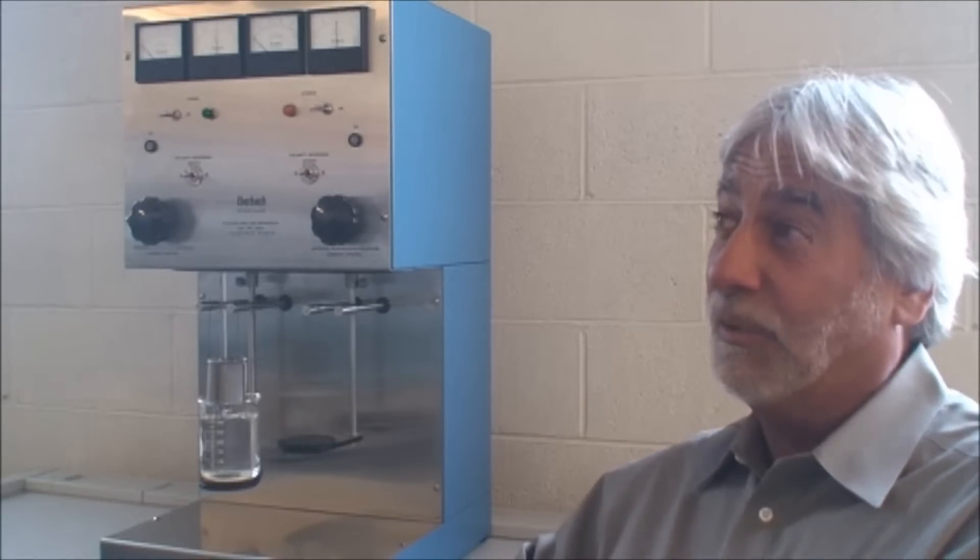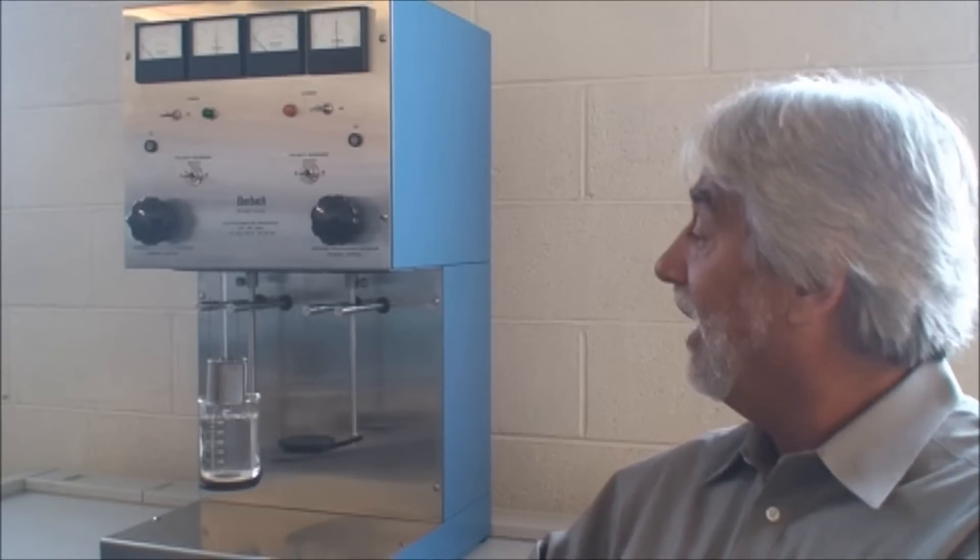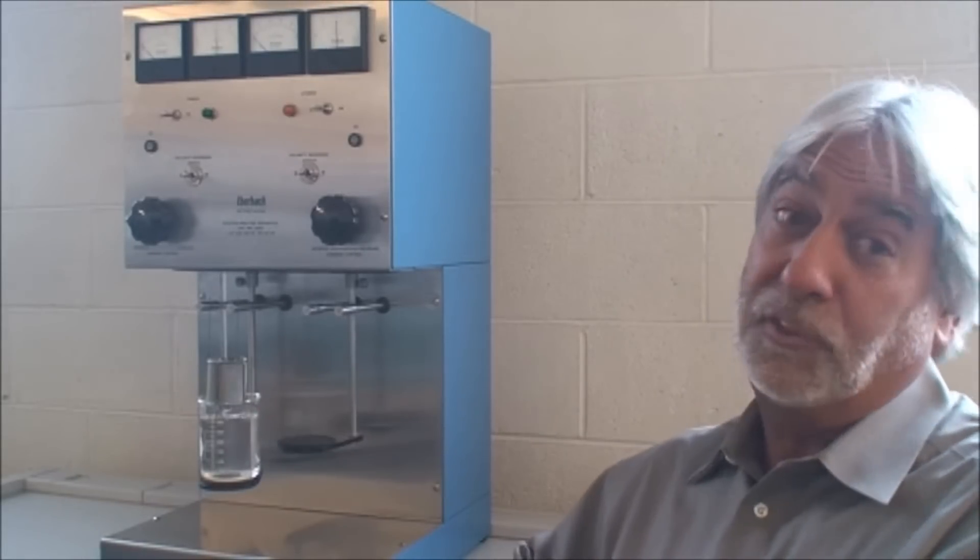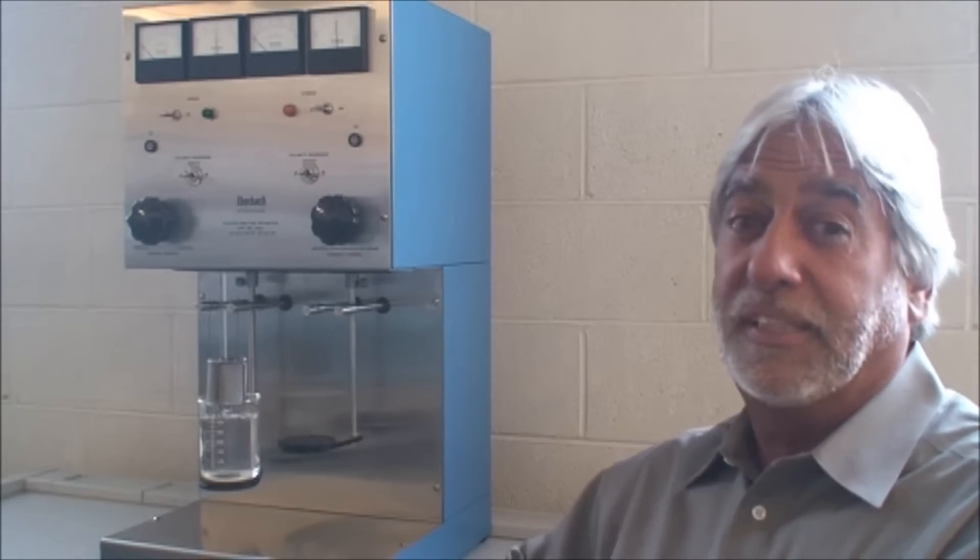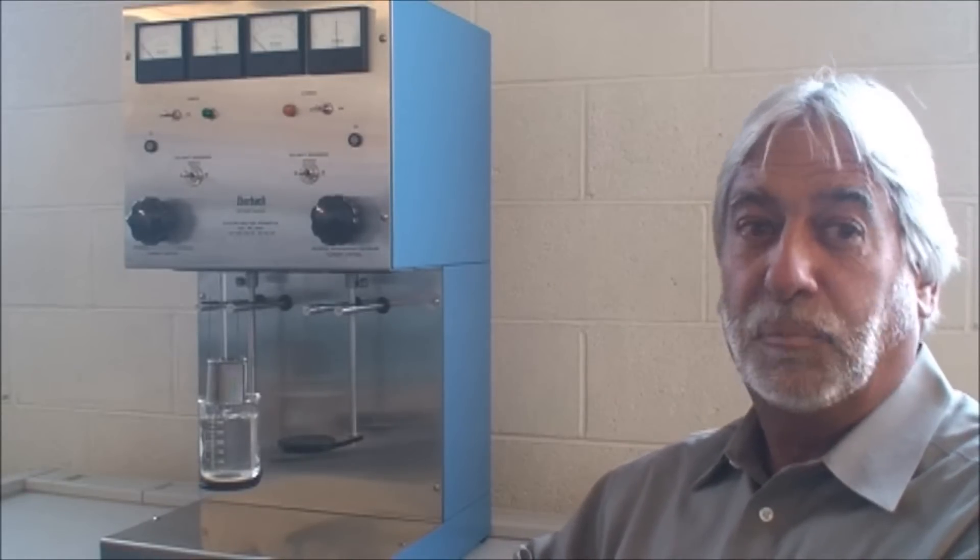To begin with, what does it do? Well, it's an electrode plater. It plates anions and cations on these platinum electrodes. Typically you would take a metal sample, dissolve them in hot acids, and then proceed to plate.